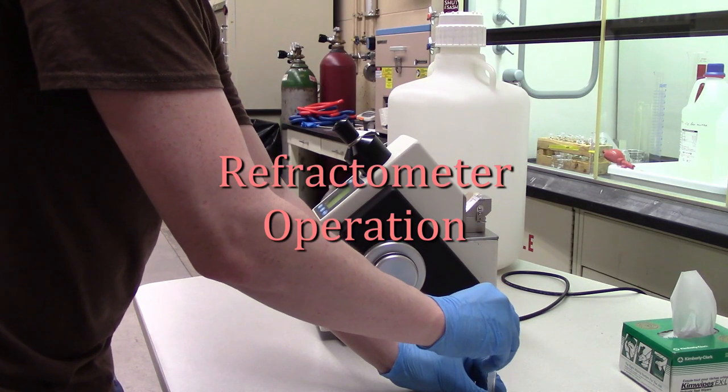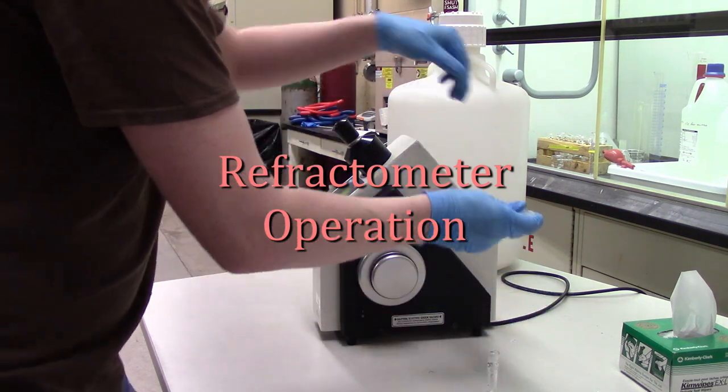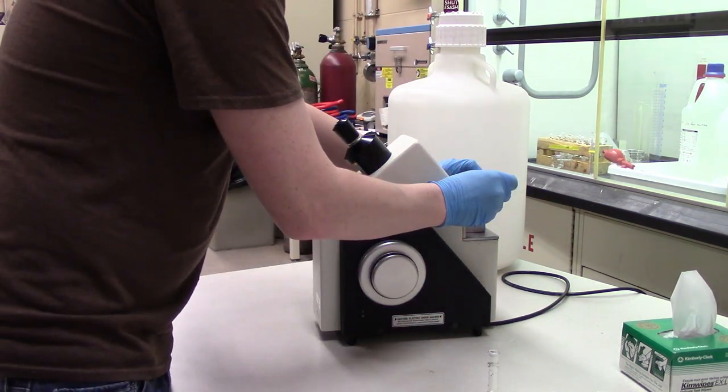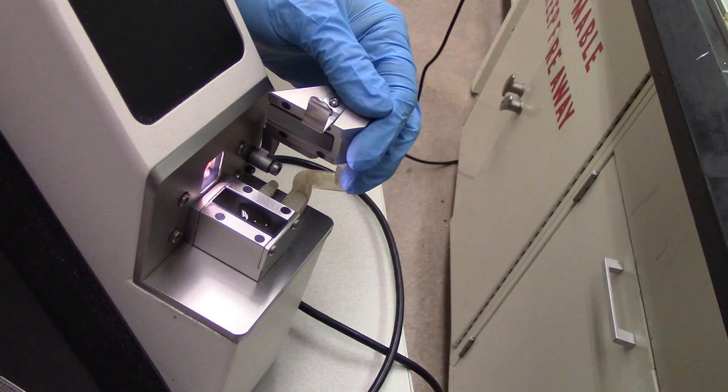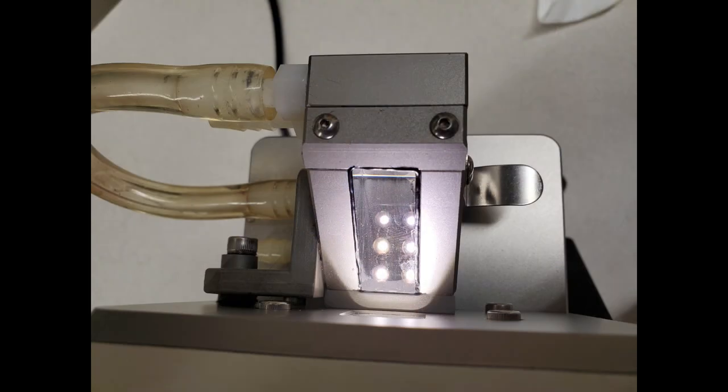To analyze a sample, use a dropper or a similar instrument to transfer a few drops onto the prism. Ideally, there should be enough liquid to wet the entire surface of the prism when closed.